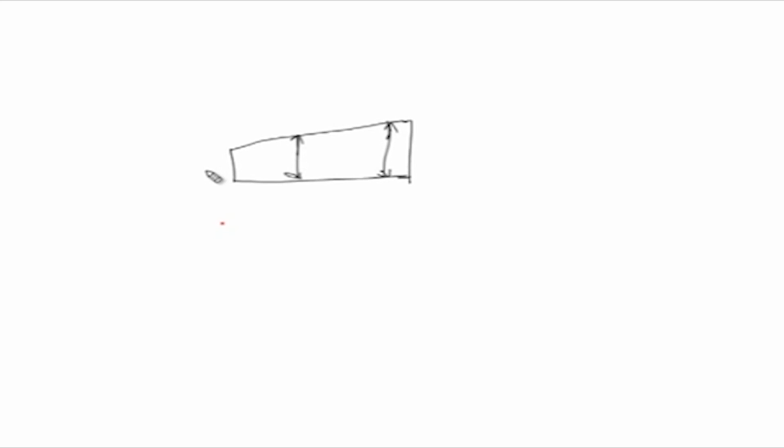When this is filled with a homogeneous solution, there is no boundary as such, and so no refractive index changes are registered. But as centrifugation occurs and the centrifugal force acts in this direction, the macromolecule starts moving towards the centrifugal end. So, a boundary is created, and this area is now devoid of the sample.